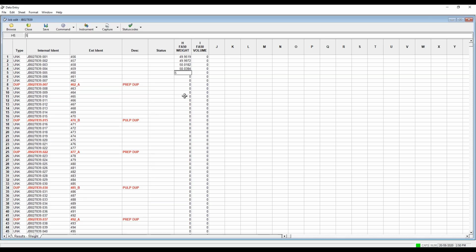Halfway through, I'm going to stop and I'm going to type a couple in, and I'm going to save that data. So we all know that it's possible to manually enter data into CCLAS. There's not an issue with that. We can prevent that, by the way, and if necessary, we could tie locking these data cells up to stop that manual entry being put in.